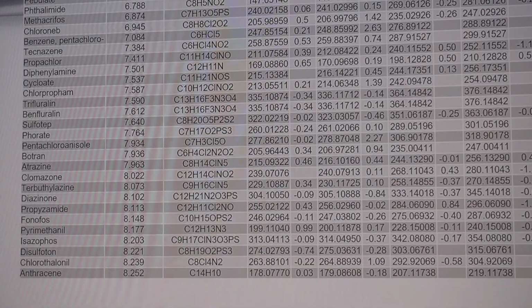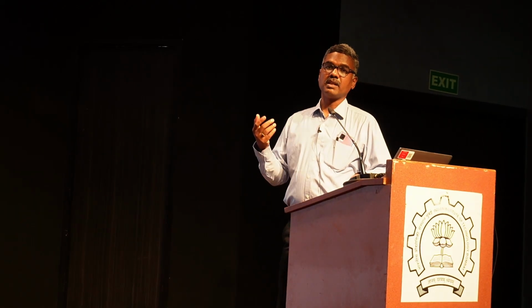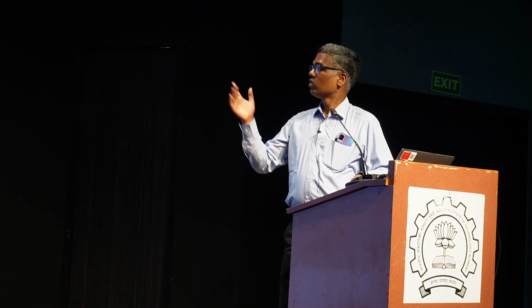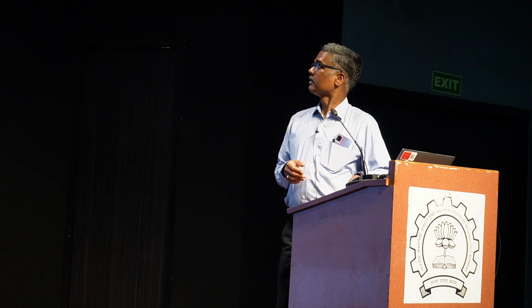This is another example, screening of the additional contaminants apart from PAH, PCB. You can get some pesticides also, some other PAHs which are available in that, which may not be your target in the first objective, but you wanted to screen that same sample with an untargeted approach. You can get that information in this tabular form also through Compound Discoverer.